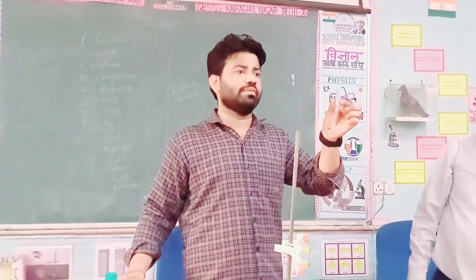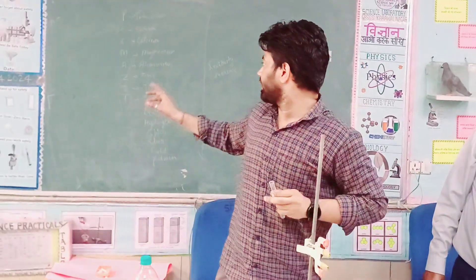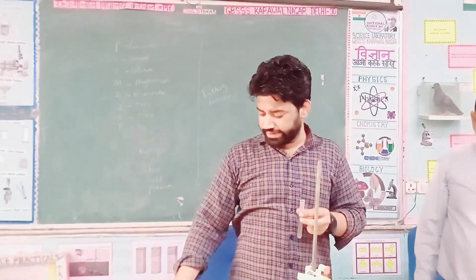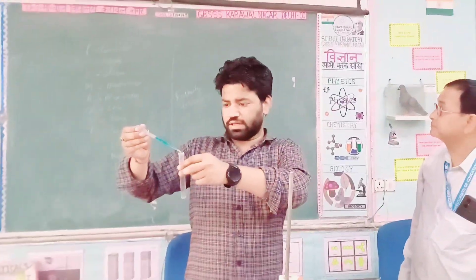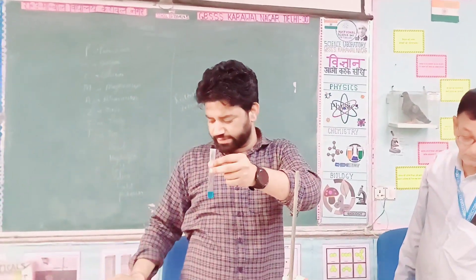This is Zinc, Sulphate, Aluminium. We will tell you which metal is more reactive and which is less reactive. First, we take copper sulfate solution, which is blue in color.